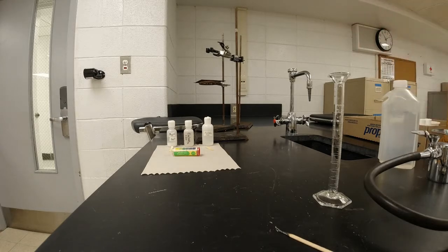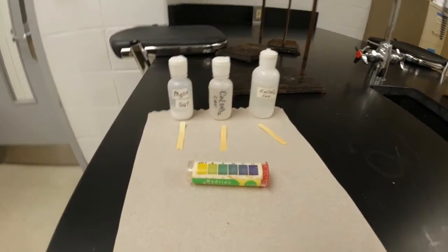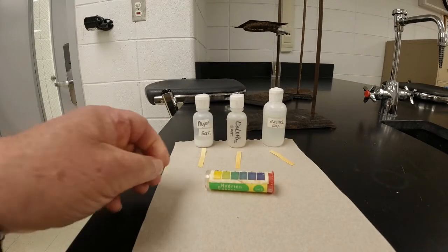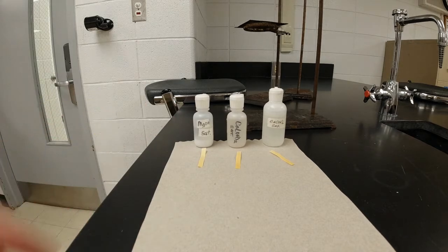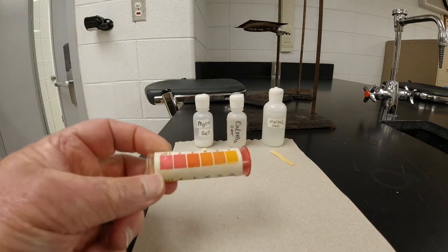I'm going to shut off my Bunsen burner because I don't need that anymore. And what I have here, you guys, is pH paper. Okay, let me set this down and arrange this thing. I have some pH paper, all right? And pH paper is a colored piece of paper. I have 3 strips of them there. When I put chemicals on it, I can tell the pH.